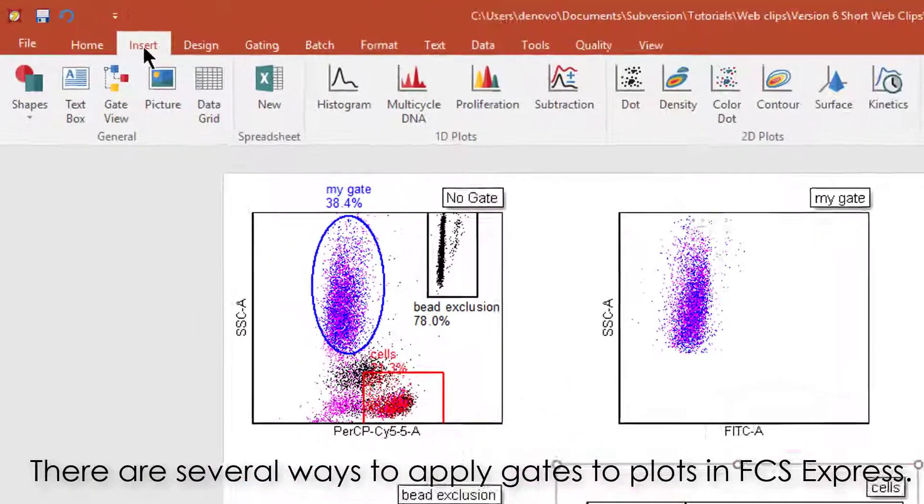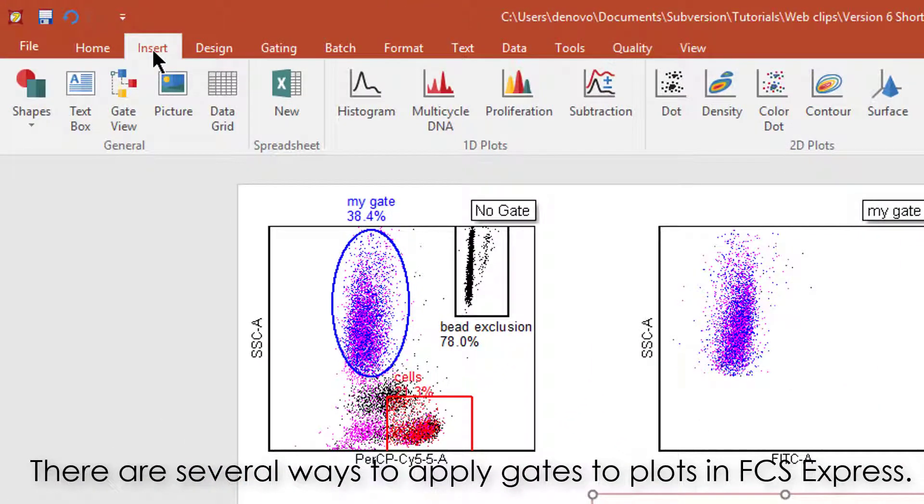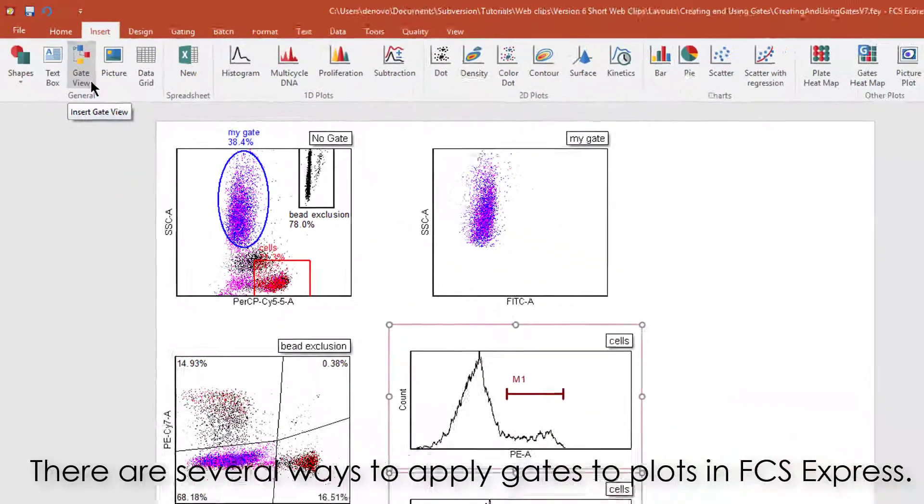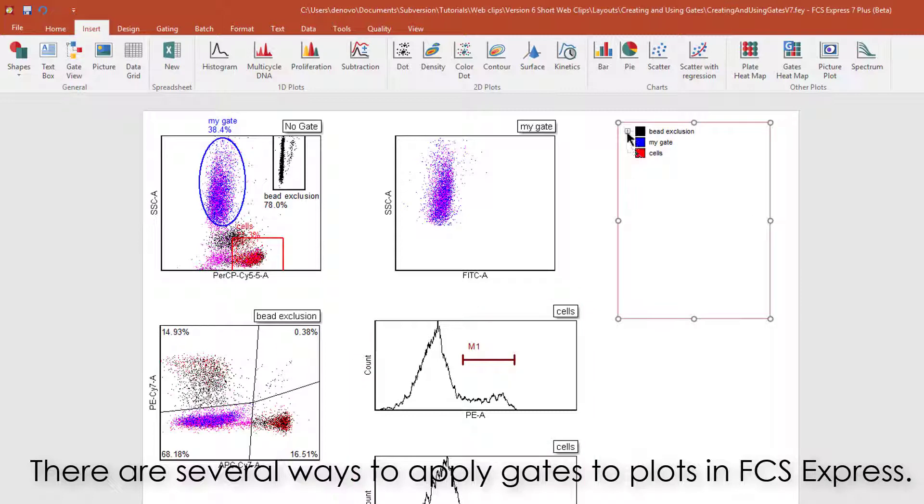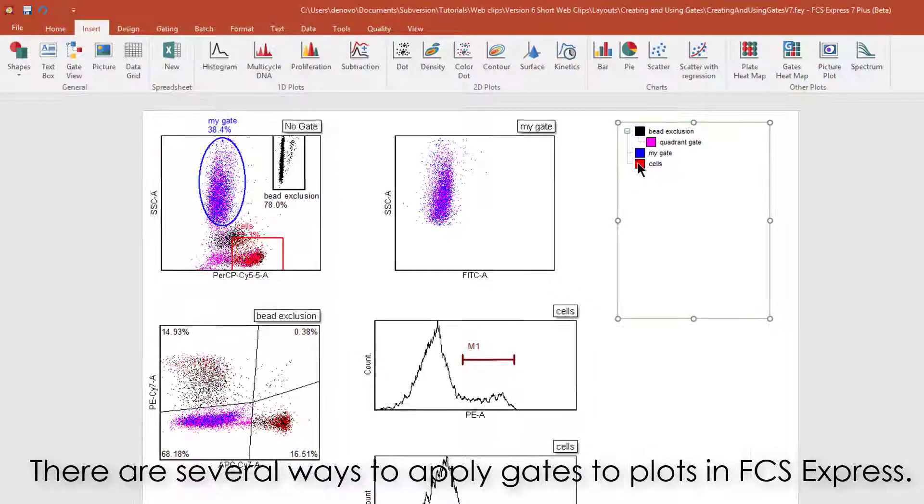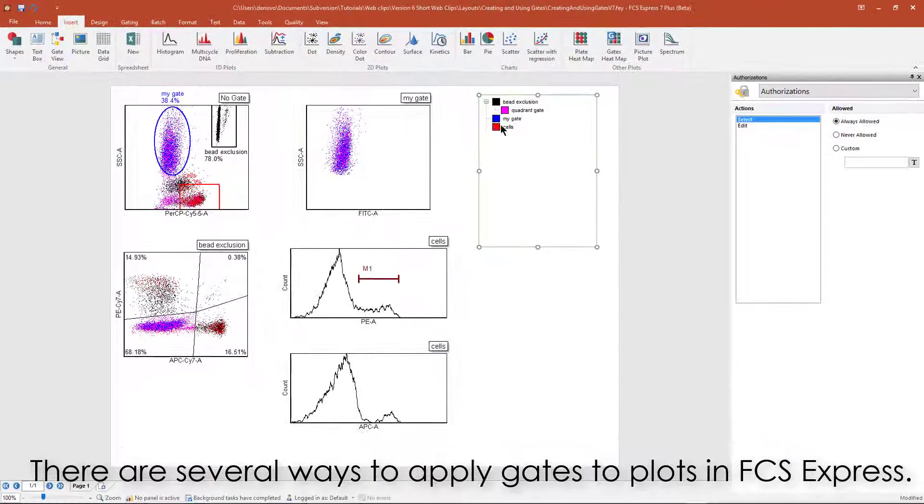A third way to apply gates in FCS Express is using the GateView object on the Insert tab. Here, you can drag and drop any desired gate to any plot.